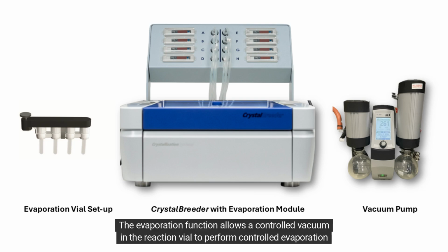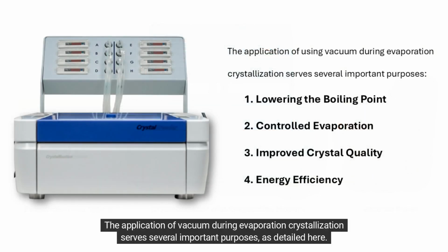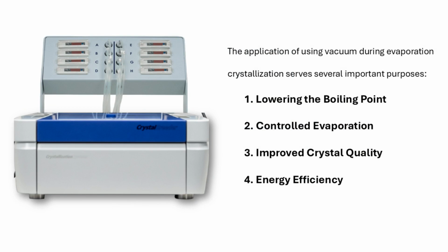The evaporation function allows a controlled vacuum in the reaction vial to perform controlled evaporation studies, depending on the vacuum set on the vacuum pump. The application of vacuum during evaporation crystallization serves several important purposes, as detailed here.